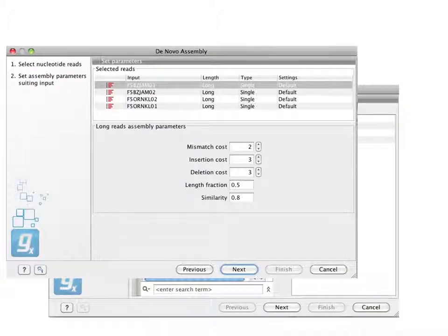You would do the assembly. You could also use Trinity for the assembly. We actually used TopHat, which I'm going to show you in a second, for finding SNPs now, but it's analogous in this particular software. The assembly is what stacks all the reads together, so you get this. Okay.